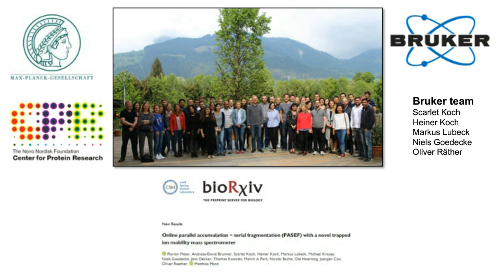Is it possible to use timsTOF Pro for metabolomics experiments? I think from our experience, it should be possible, but in this study we did not perform experiments in this direction.